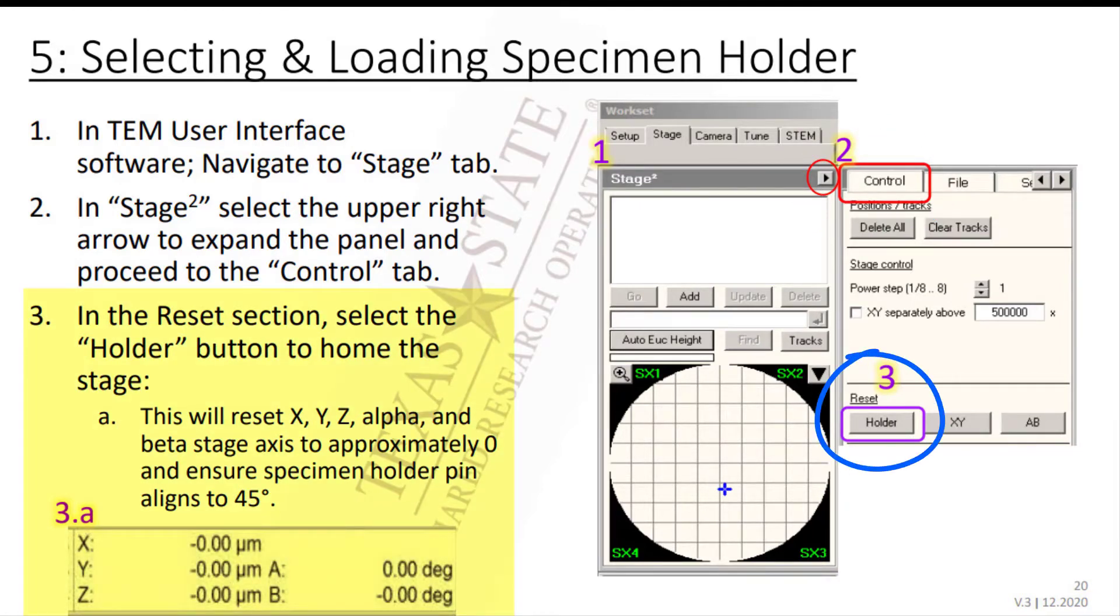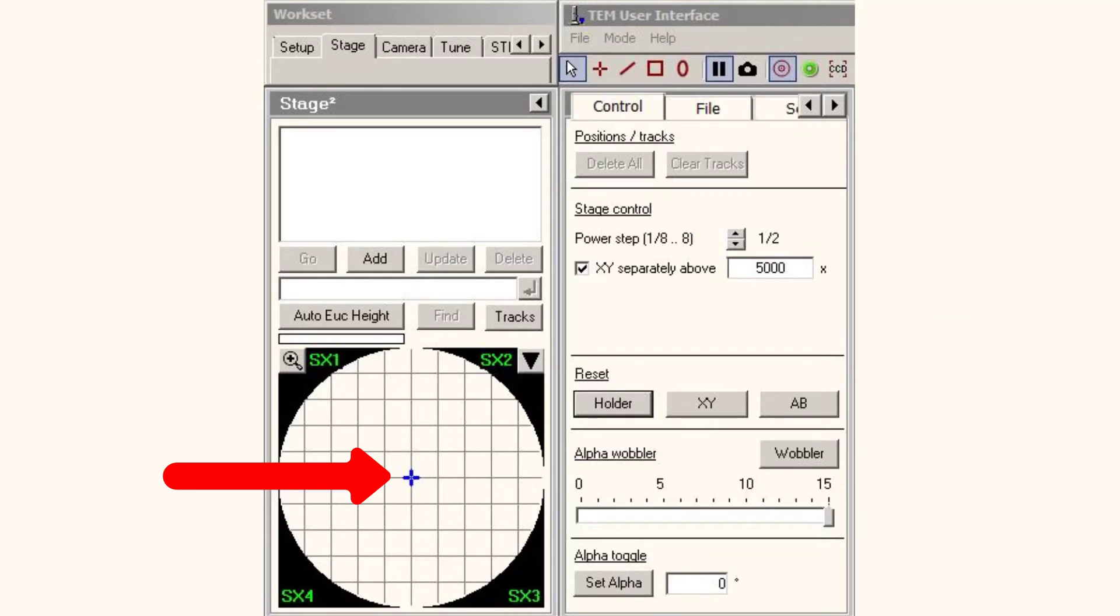In the Reset section, select the Holder button to home the stage. This resets the position of X, Y, Z, Alpha and Beta to approximately zero and ensures the specimen holder pin aligns to 45 degrees.